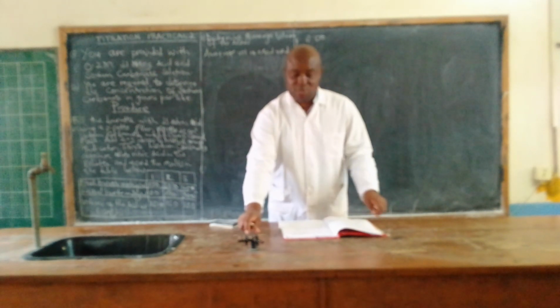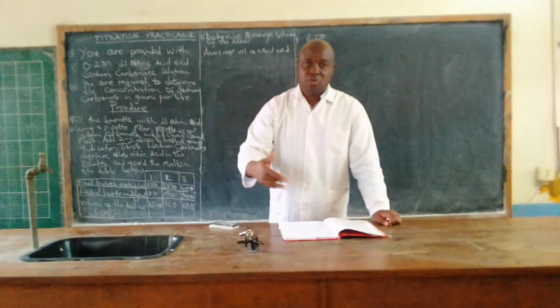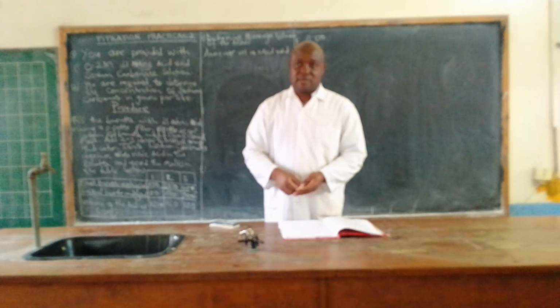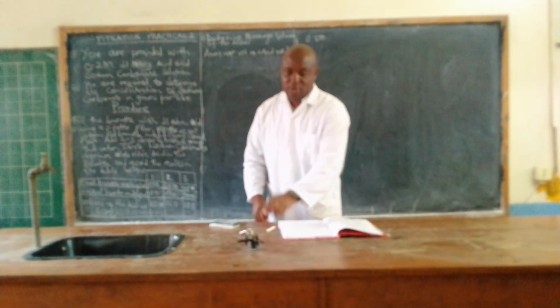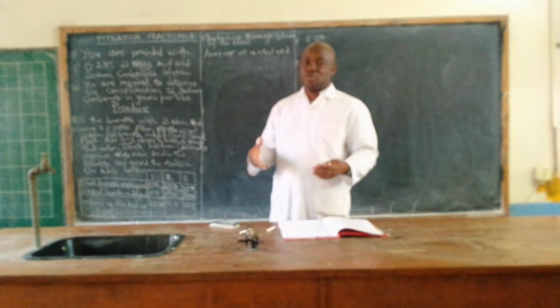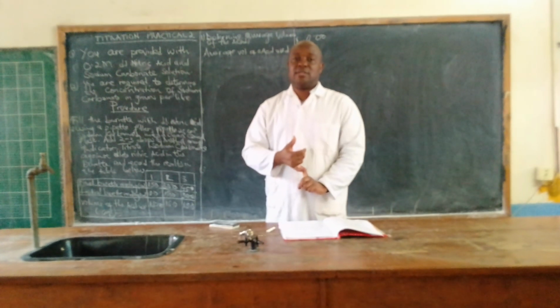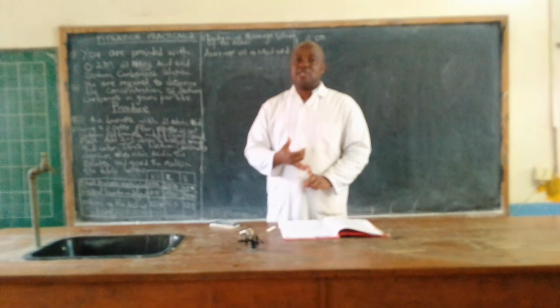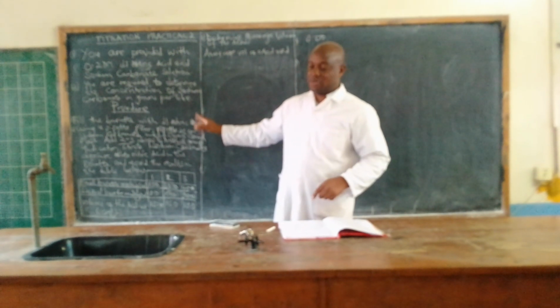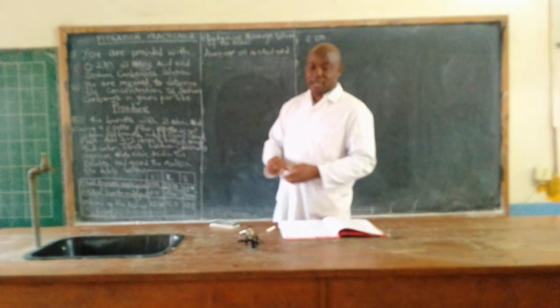Today we are going to continue with a series of titration practicals. But today we are just going to go through some of the questions that usually are tested in the practical classes, in as far as the nitric acid and sodium carbonate is concerned. There is a procedure on the board that I've already written to save time for this discussion. So I will just take you through the procedure as we continue with the other calculations.